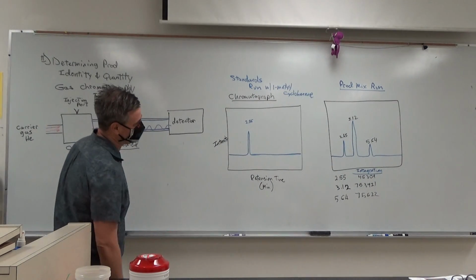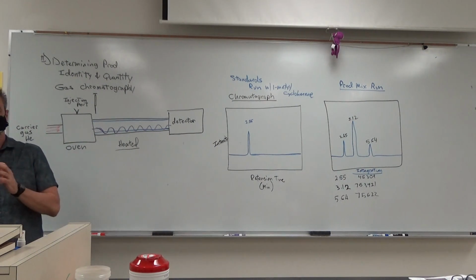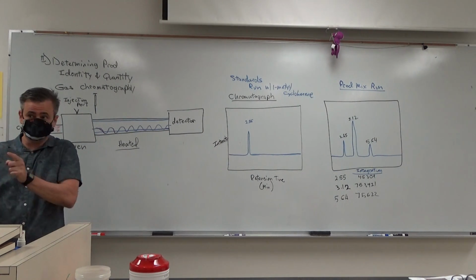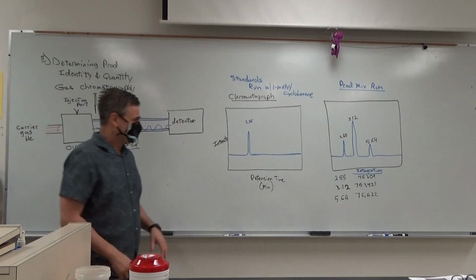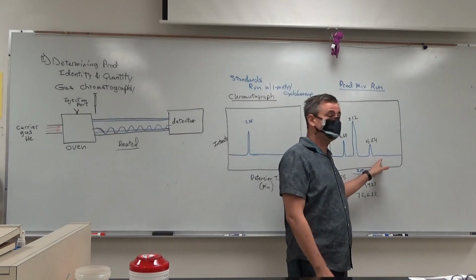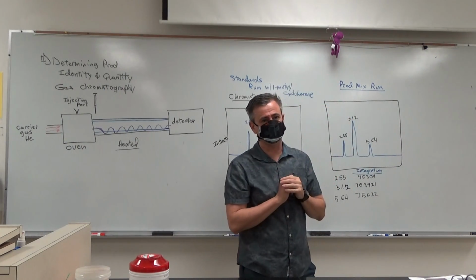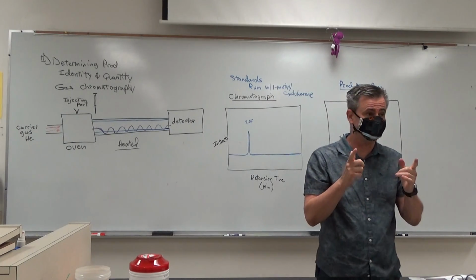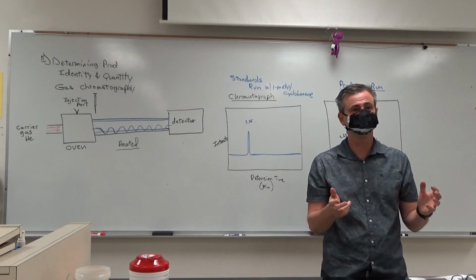Okay, so that's how it works. Does that make sense? That's how you're going to identify yourself. You'll get a readout for your product mixture. Assign it to what you think. Some of the components you may not be able to assign. If you have one that's way out here, sometimes that's unreacted alcohol that somehow made its way up into the Hickman head. It makes sense that an alcohol would have a much longer retention time, because it has a much higher boiling point.